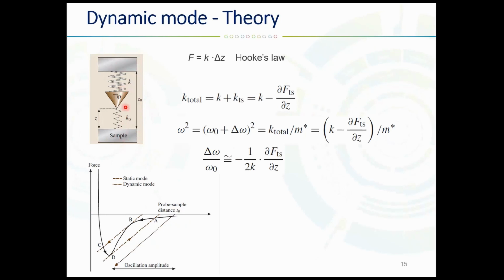And here we have two springs. The tip is attached to a cantilever with a spring constant K, and the force interaction is modeled by a spring stiffness equal to the force gradient.